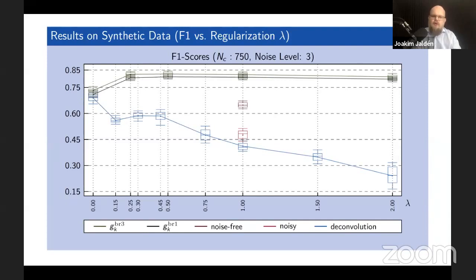But once you start to saturate the antibodies, you enter into nonlinear effects, right? Because you can only have as many particles captured as you have antibodies. So there is an upper limit, which is not consistent with the linear model. We've found that actually saturating the antibodies is not an issue. So in the fluorospot experiments, even if you have a lot of the cells, you're still working in the linear regime, with the type of assays that we're looking at.